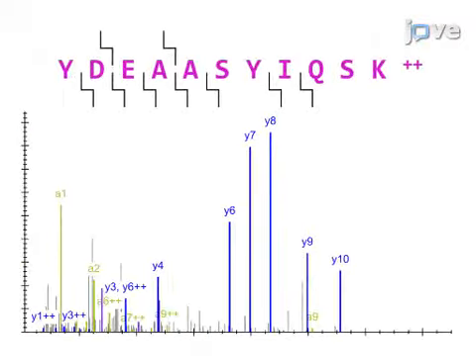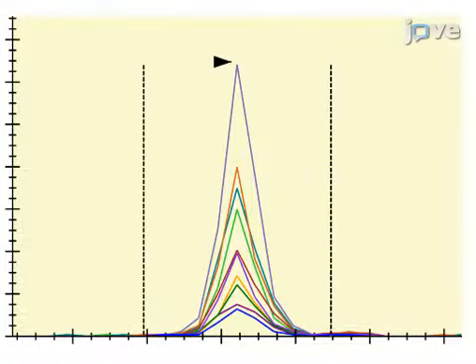Shotgun mass spectrometry was used to analyze the external peptide standards. The top 10 most intense transitions per precursor were selected for LC-SRM. LC-SRM was then used to analyze the external peptide standards. The resulting peptide identifications should be unambiguous.